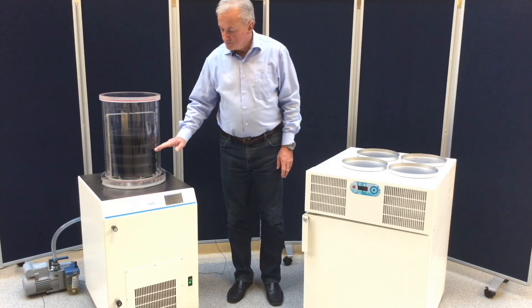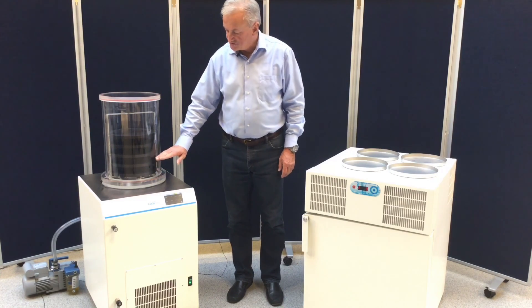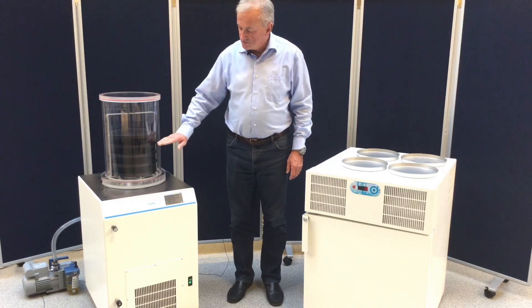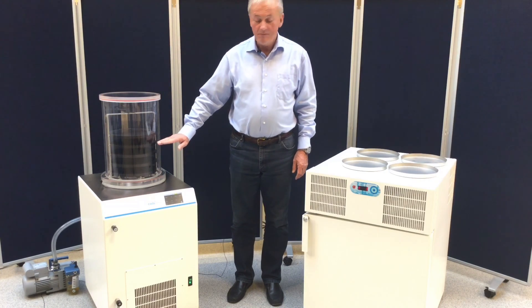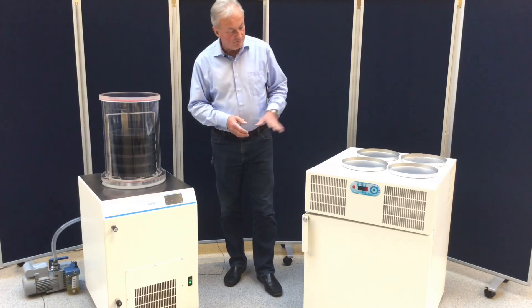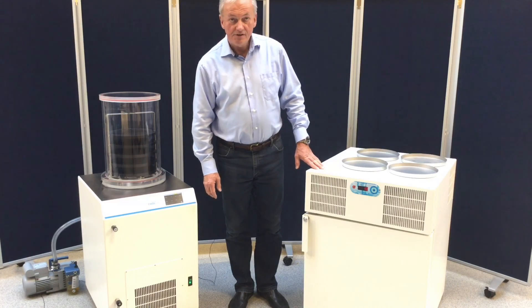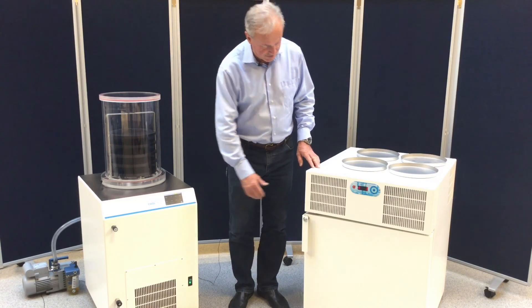This unit does not have the possibility to do pre-freezing in the chamber, because the electrically heated shelves are only able to maintain temperature from ambient up to plus 50 degrees. So for pre-freezing we need to have a freezer. For that you can use our Snowbird freezer, going down to minus 85 degrees Celsius.